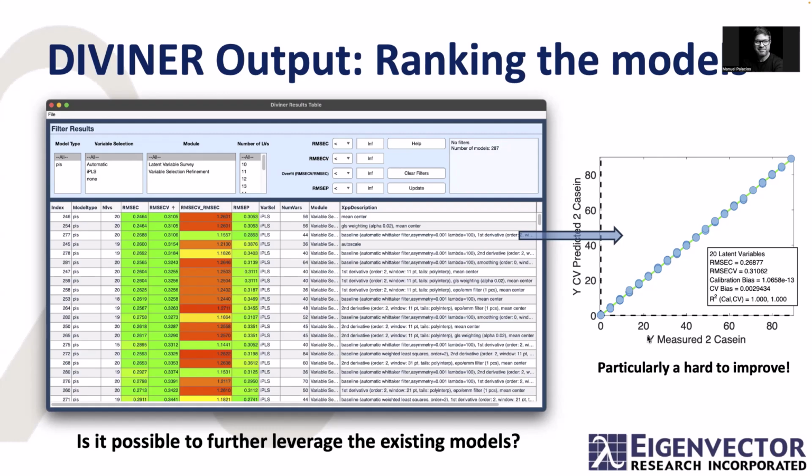So the biggest question is, now that we have all these models, and you saw that we were selecting the top 85 models from a run that started with 30,000, what can we do with those models? Well, we can certainly keep them, and that's what we traditionally do. A lot of the way the Diviner workflow works is based on how we usually handle data when it comes new into our consulting efforts.